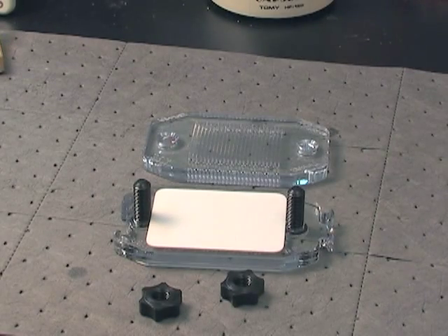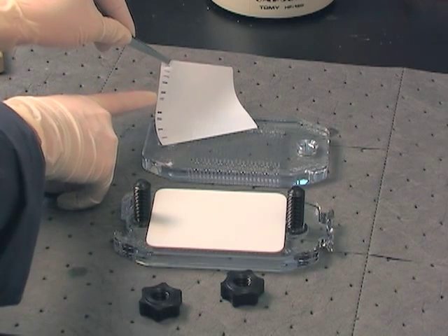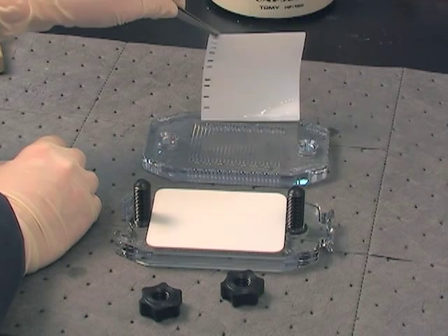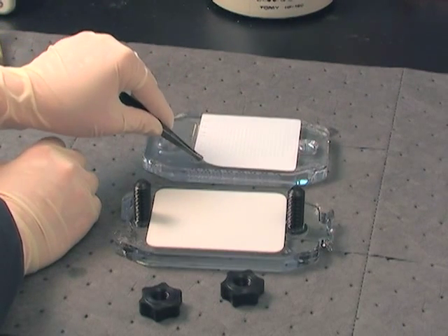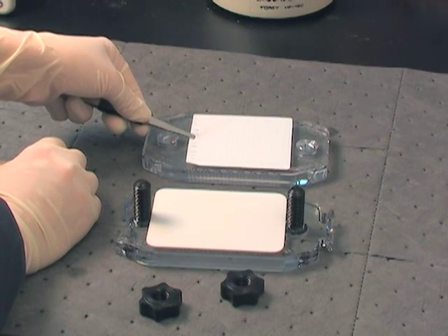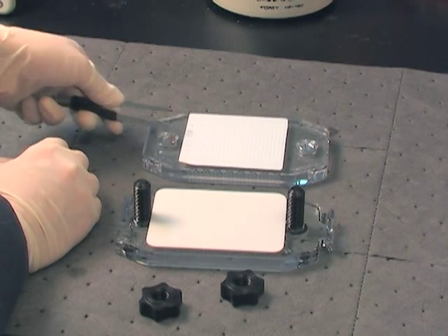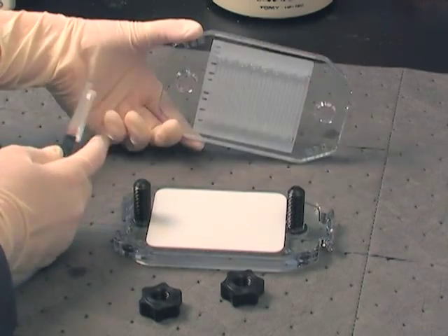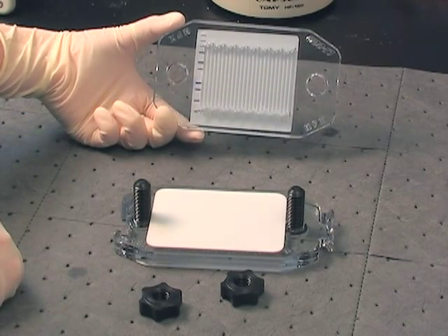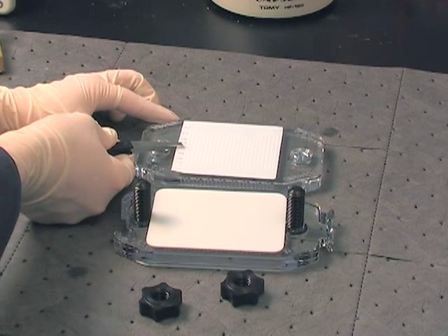After blocking the western blot for one hour, remove it from the blocking buffer, remembering to handle it with clean forceps and only by the outside edges. Position the molecular weight marker ladder on the top left with the largest molecular weights at the top of the membrane. To properly situate the membrane on the top plate, lay the membrane protein side down and align the ladder to the leftmost lane. It may be necessary to pick the plate up and check the position by looking through the top of the plate. Try to work quickly as it is important not to allow the membrane to dry out.